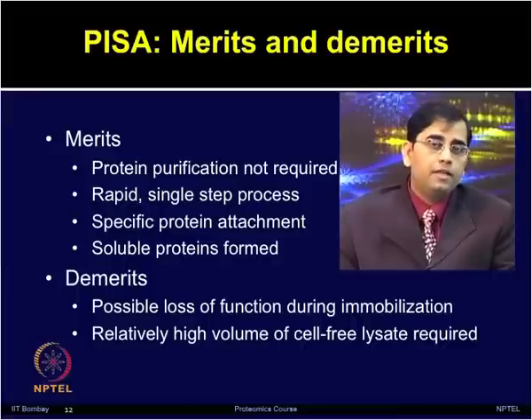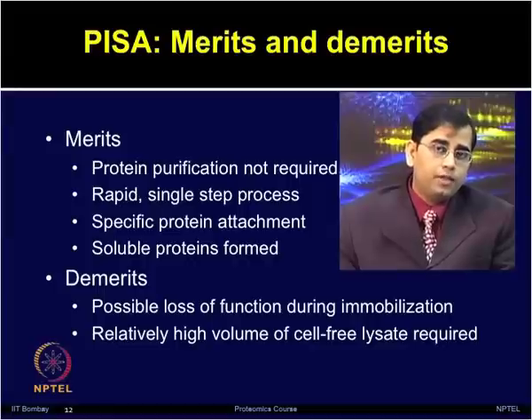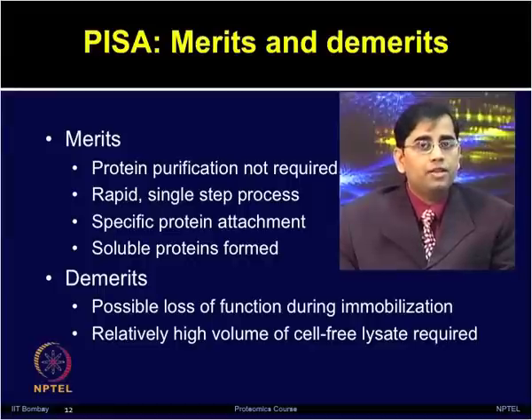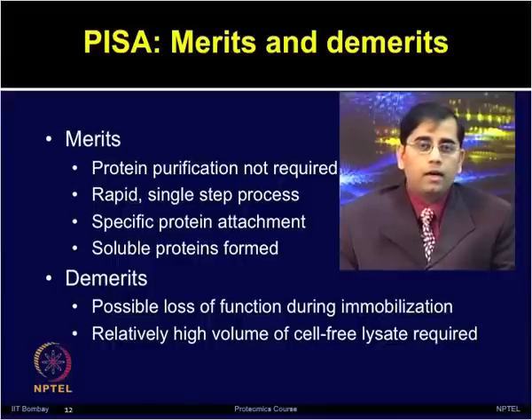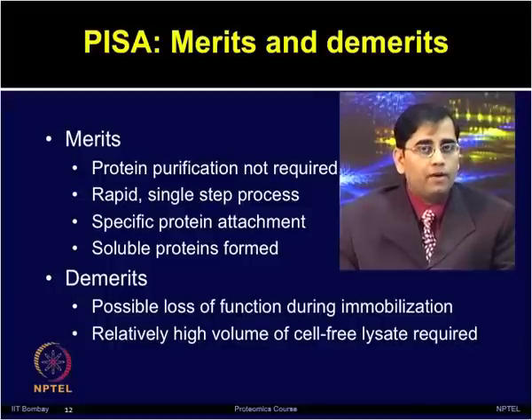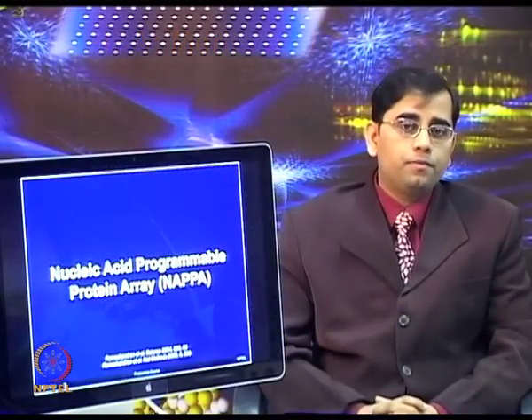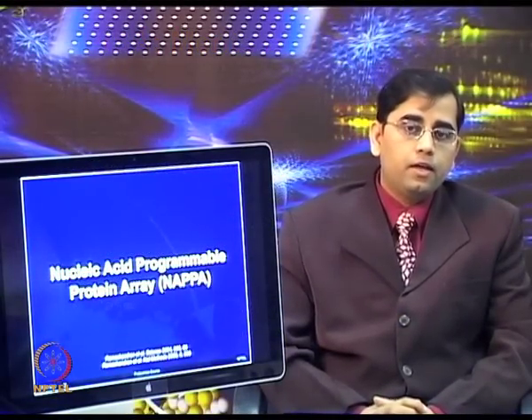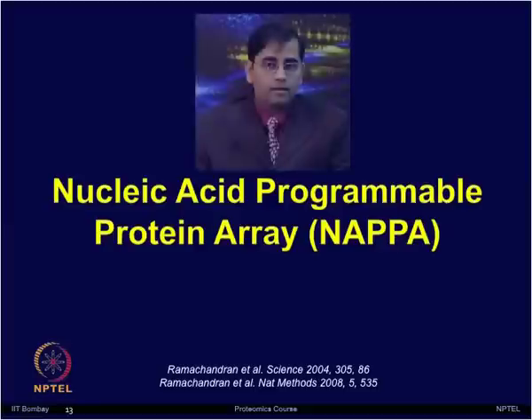Now, let us discuss the limitations of this technology. It is possible that there is a loss of function of these proteins during the immobilization step. Cell-free lysates are very costly. So, if one needs a high volume of cell-free lysate, that becomes one of the limiting factors for using this platform. Let us now move on to another technology, nucleic acid programmable protein arrays, also known as NAPPA.